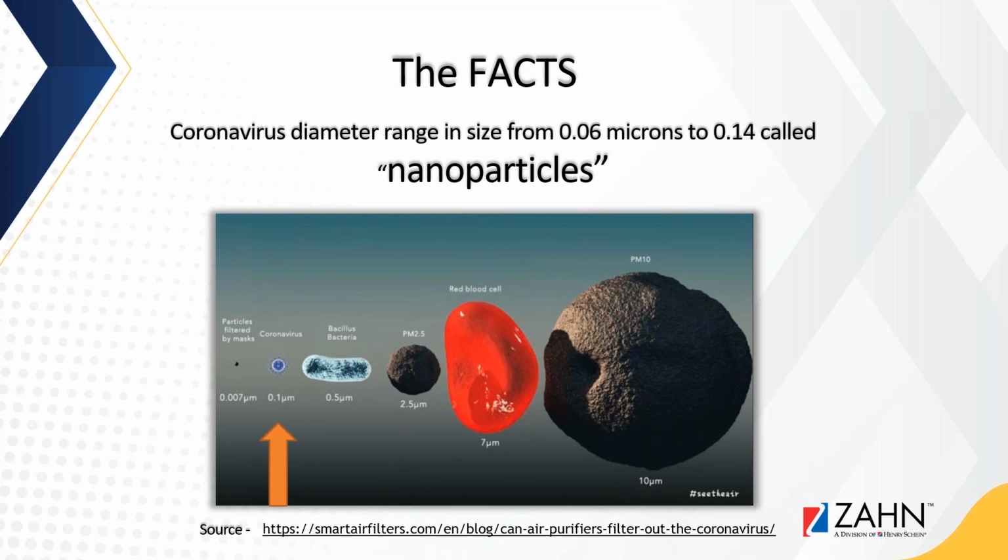In the case of dentists, they were concerned that droplets would be one of those vehicles. And the fine droplets or aerosols vary in size anywhere from 0.5 to about 5 or 6 microns, which is much larger than the 0.3 microns that HEPA filters are rated for. Now, we also know that the coronavirus remains active for several hours to several days, depending on the surface. So once caught in the filter, the virus will eventually become inactive.